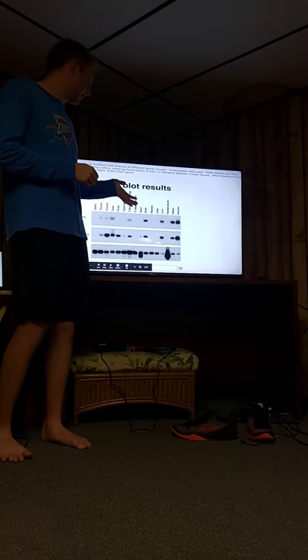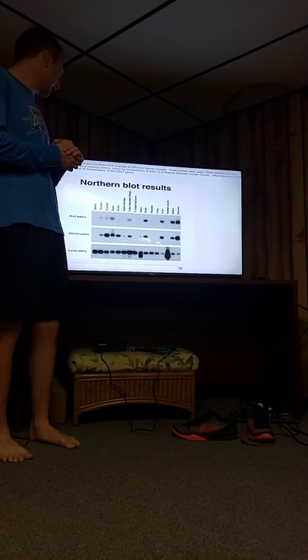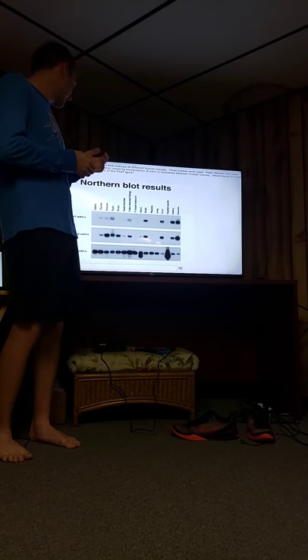So here I have an example of somebody's northern blot results. They were doing different parts of a human anatomy. We have stuff like the heart, the brain, the lungs, and the liver.